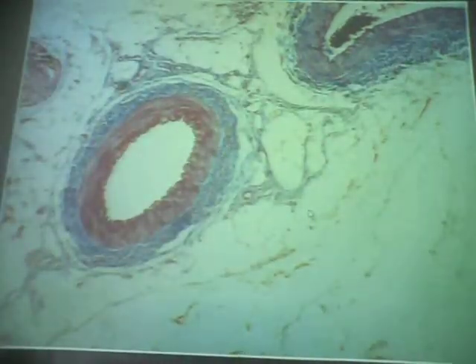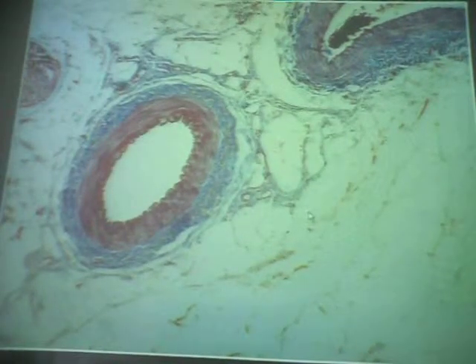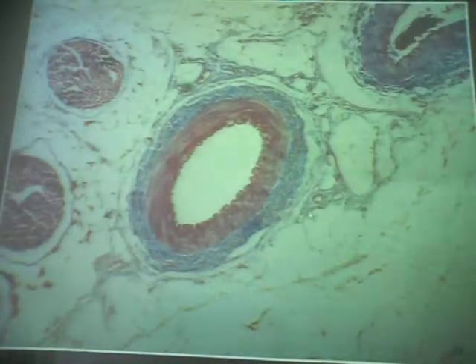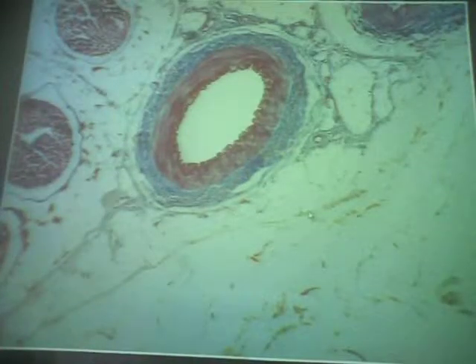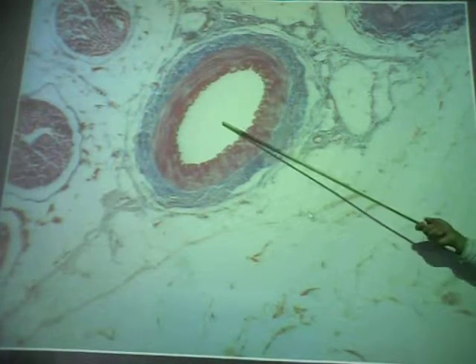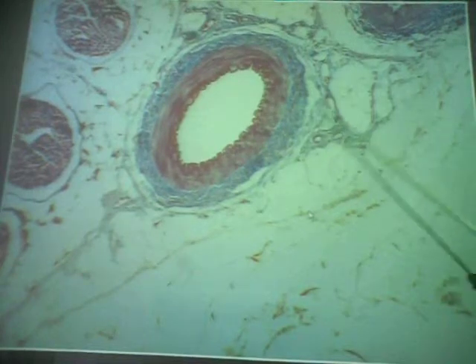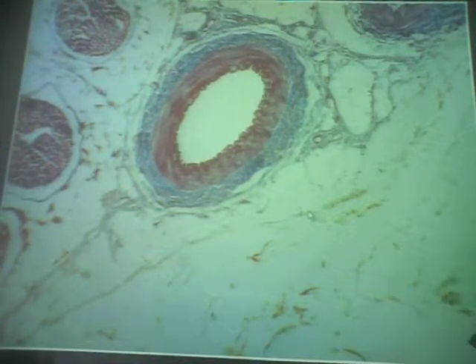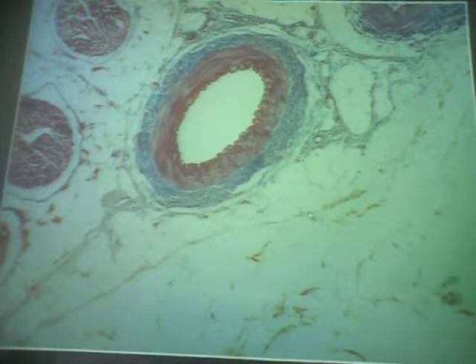Okay. So we're going to start here, and first off, you can see a vein and artery. What is this? Artery. That is an artery. You can tell because they tend to be smaller than the corresponding vein. They have a smaller lumen overall, that's where the blood flows, and a thicker wall because they have to handle blood of higher blood pressure. And generally speaking, they contain blood of higher oxygen content than the corresponding veins.